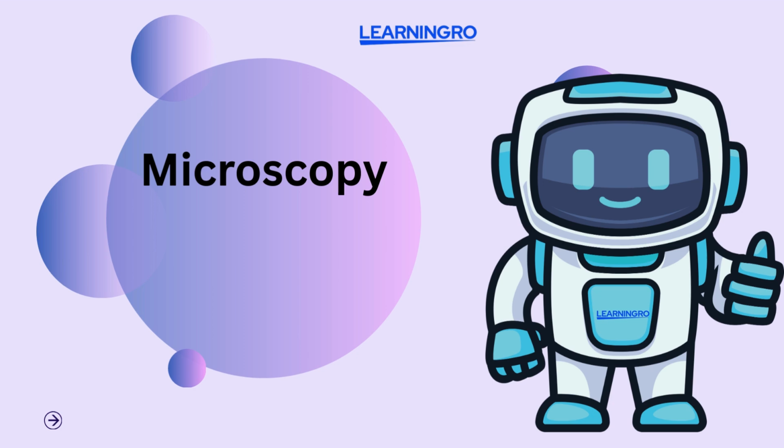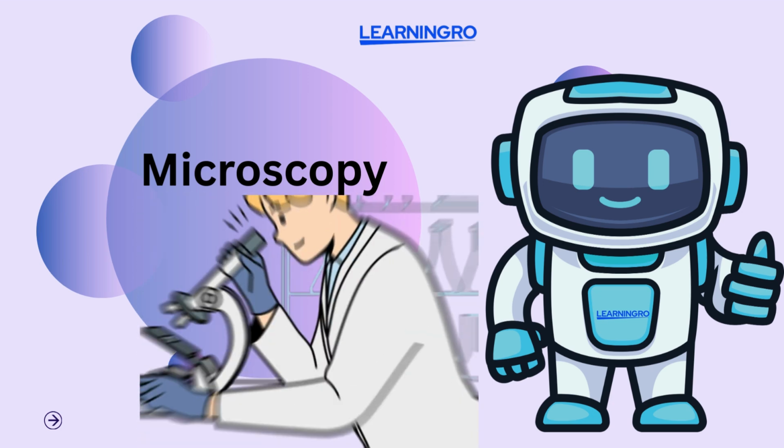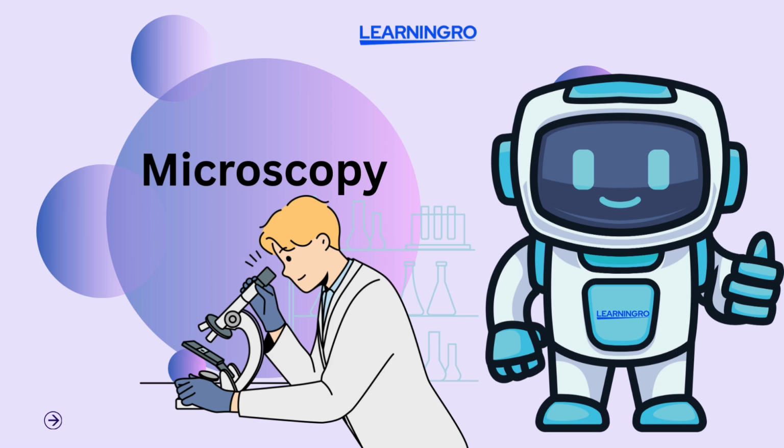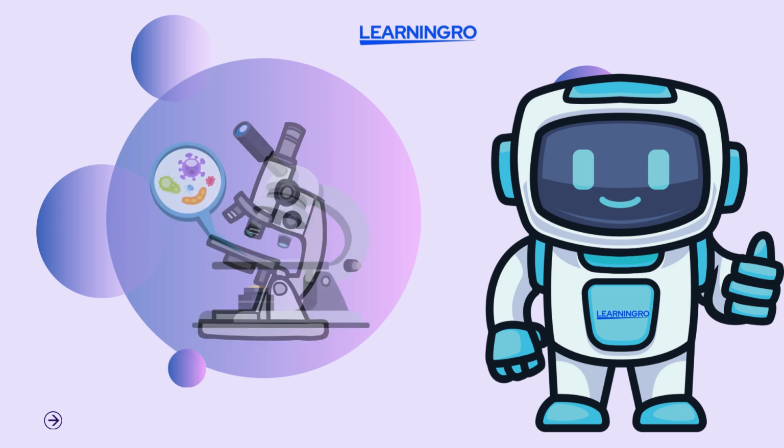Microscopy. 1. Introduction to Microscopy. Microscopes play a crucial role in biology by allowing scientists to observe structures that are too small to be seen with the naked eye. Over time, microscope technology has advanced significantly, leading to improved magnification and resolution.